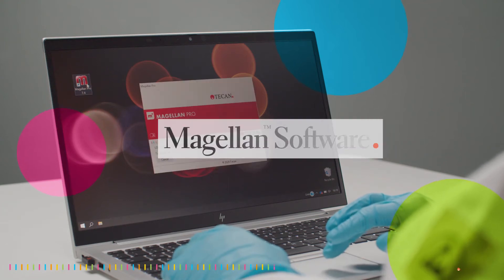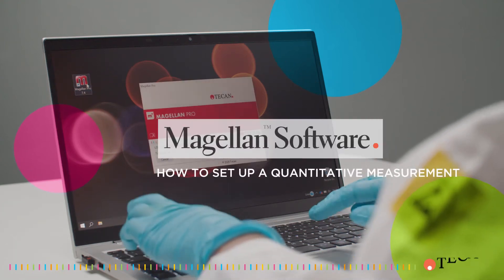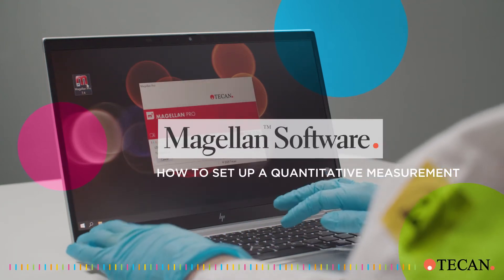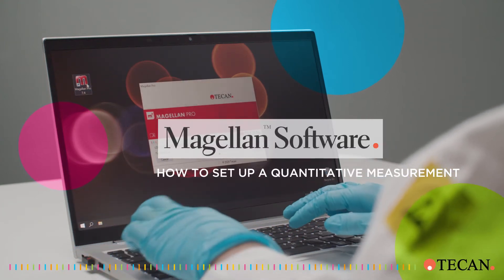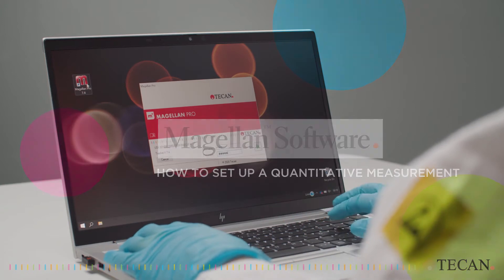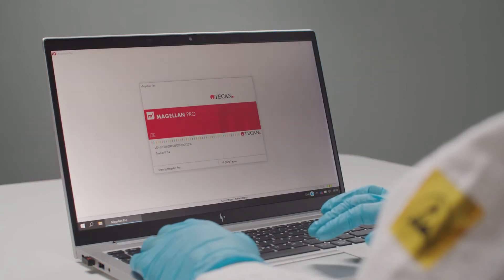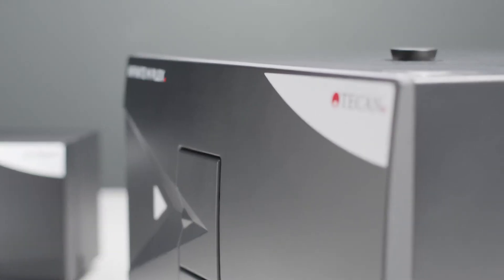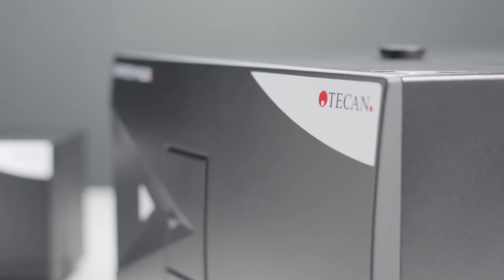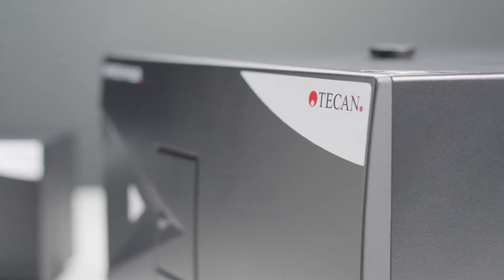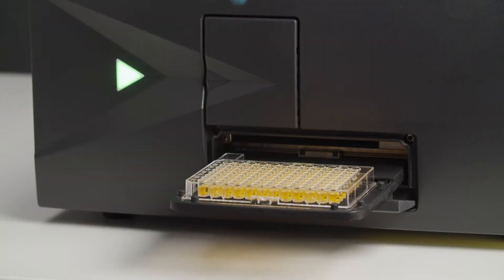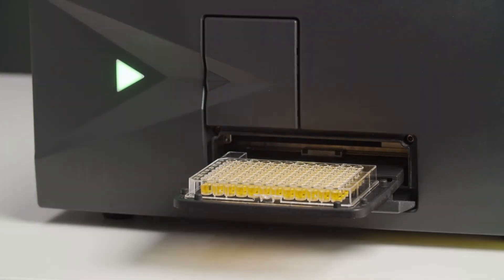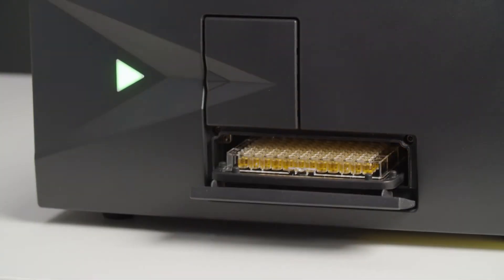Hi and welcome to this video tutorial on how to set up a quantitative measurement with Magellan software. Magellan software helps you control your microplate reader and analyze the data of your Tecan instrument.